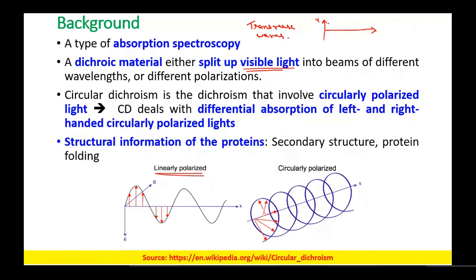If you see the light waves, they move in a sinusoidal wave in the direction of the propagation. So I am marking the direction of the propagation in this axis, which is basically the x-axis. I am marking it as P. Now we all know these visible lights are nothing but electromagnetic radiation.